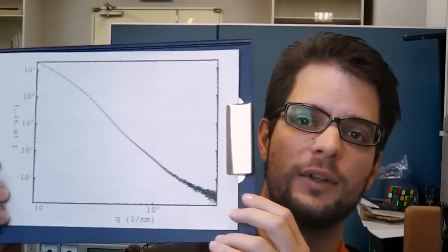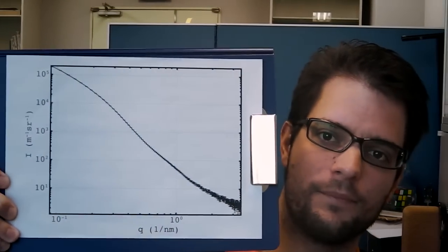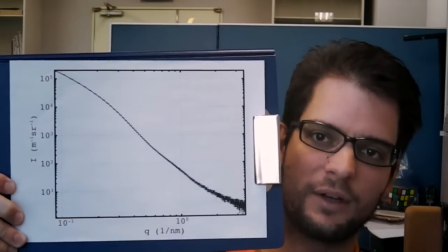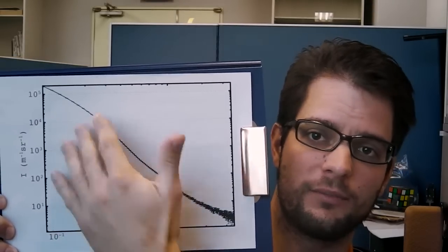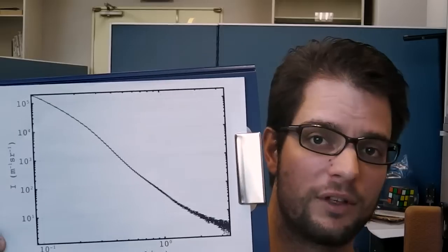Imagine that you're a small angle scatterer and you have measured a polydispersed sample and you've collected and corrected the data, and it looks a little bit something like this. This scattering pattern, plotted here on a double logarithmic plot, shows some features, so you know there's some information there, and you want to find out more about your sample.